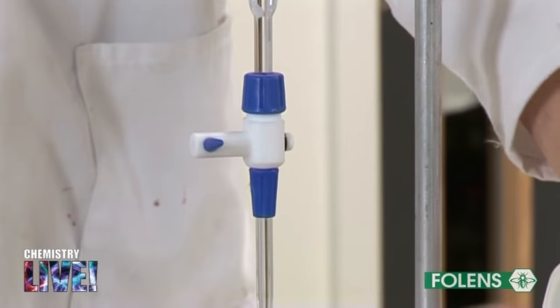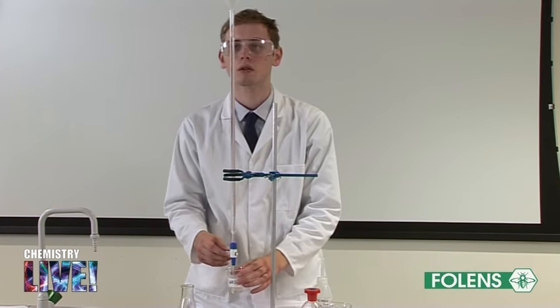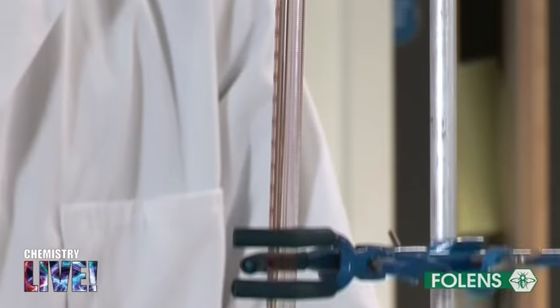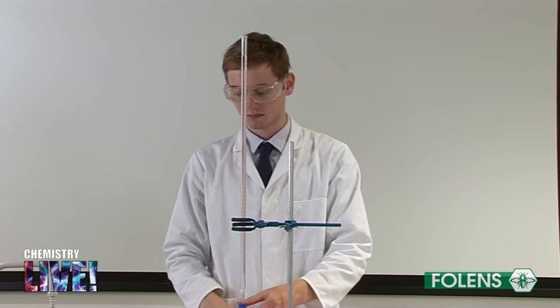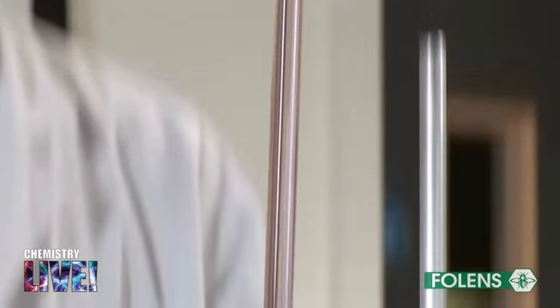Open the tap briefly and allow some of the liquid to run into a beaker marked waste. This is done in order to fill the tap and the space below the tap. Remove the funnel from the burette. If you forget to do this, you may introduce an error into your readings, as drops of liquid may fall from the funnel in the course of the titration.